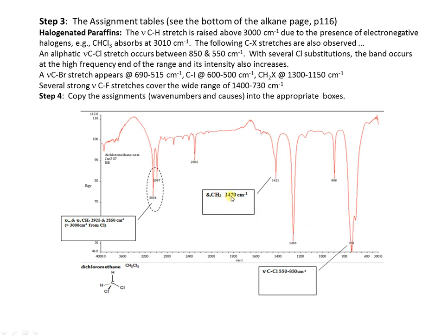The band at 1470 from the methylene group has certainly dropped lower in this case. All alkyl halides will be identified in a later course by means of mass spectrometry, and you'll find that to be much more successful and satisfying. That's it for now. Good luck with that.